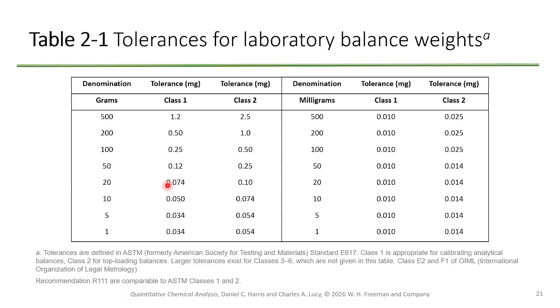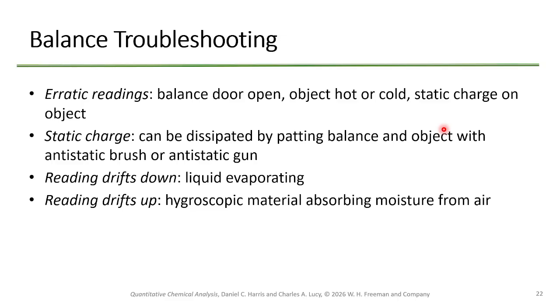Right here, these are different denominations and different tolerances depending on the class of your balance. Okay. These tables are one of the most useful things in the book, by the way, if you go out into your career. Because there's not a lot of places where it's actually collected. And people lose the damn manuals all the time. Or sometimes they just don't have them on them, like our calibration weight, which is bizarre.